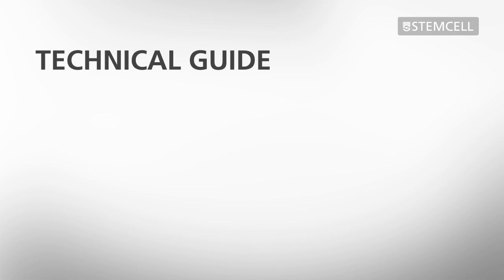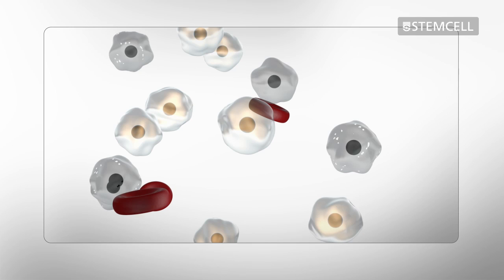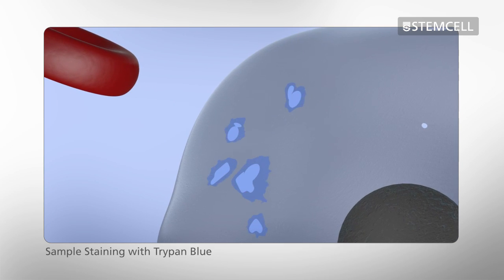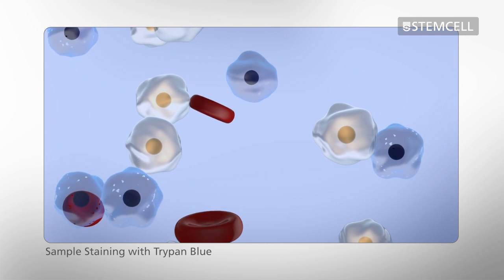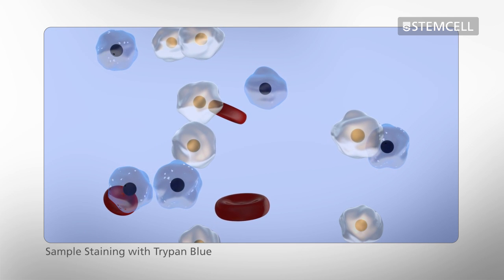We will now demonstrate how to prepare samples for viability counts. Trypan Blue is used to distinguish between live and dead cells. Live cells have intact cell membranes while dead cells have compromised membranes. As a result, Trypan Blue will cross the leaky membranes to stain the cytoplasm of dead cells blue, while viable cells remain unstained.